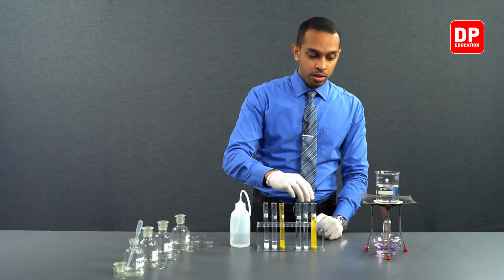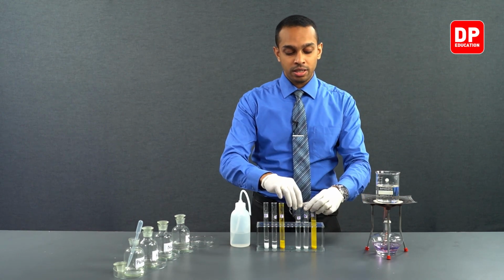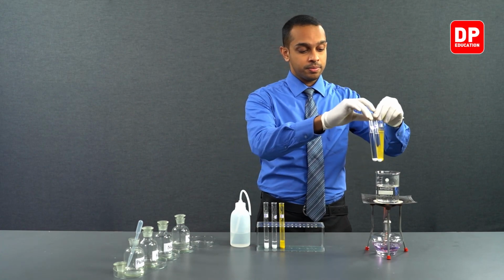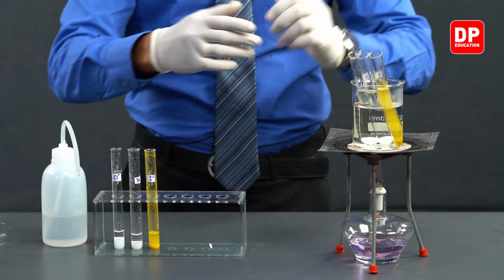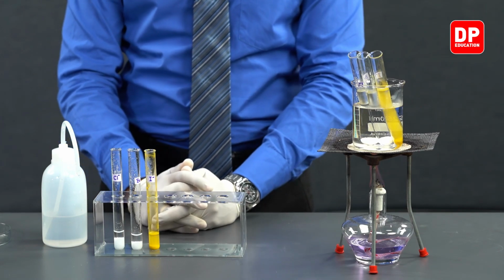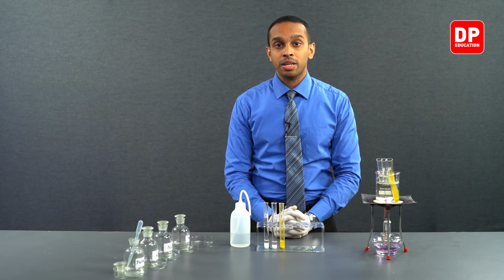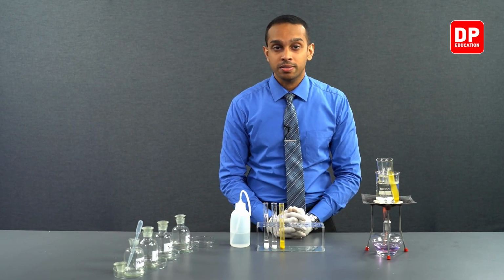So as the water heats up, we will be transferring these three test tubes onto our water bath. And we will observe over time how these precipitates will dissolve in the hot water. So we will give it a few minutes and we'll come back and see whether the precipitates have dissolved or not.